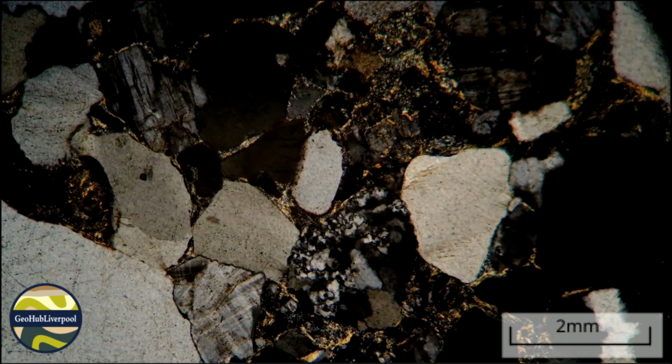The grains are largely composed of feldspar and quartz, although there are also a few lithic or rock fragments. Quartz is identified by its grey and white first-order interference colours. It's best identified by its lack of cleavage and twinning.